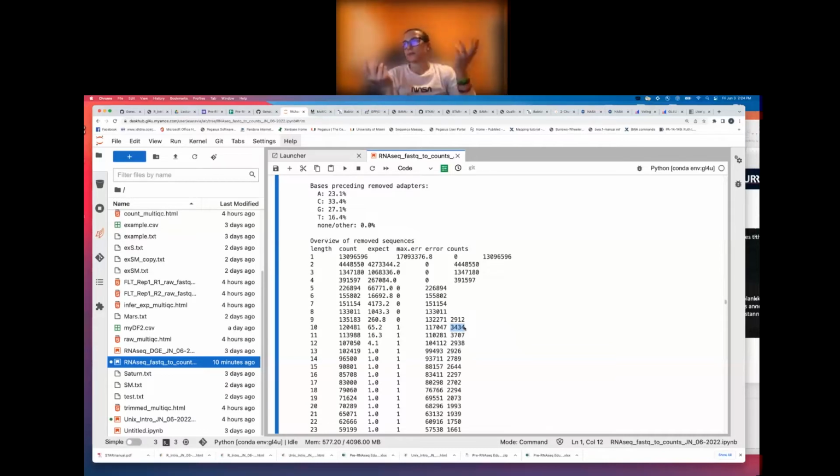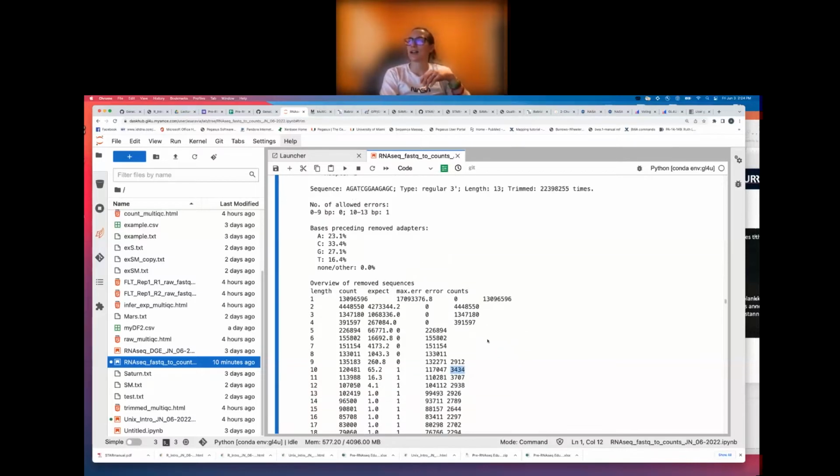So again, really more information than you guys probably need to know. But this was a question when we were doing a dry run of this that people really wanted to know what these columns were. So that's a summary of what those columns are.